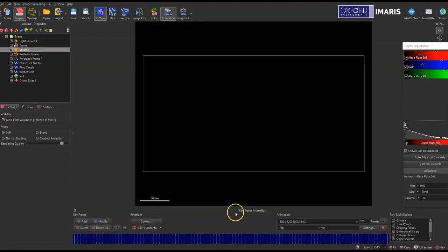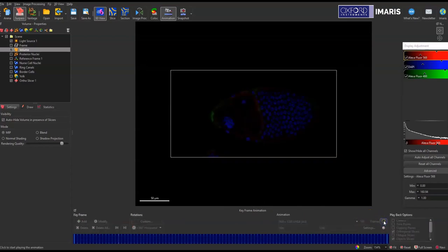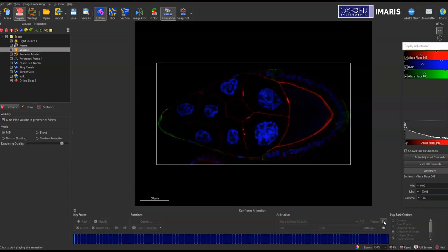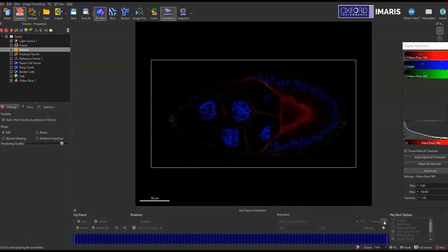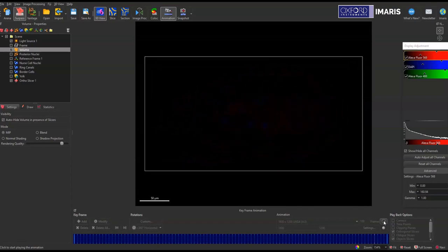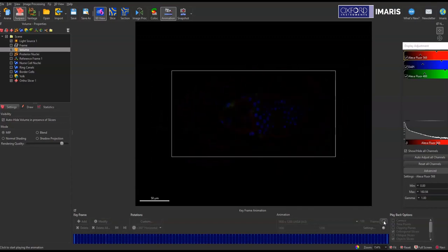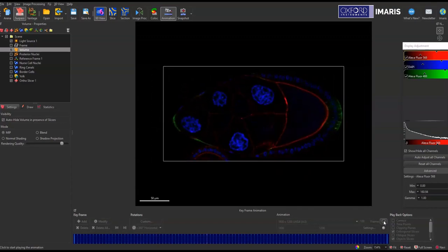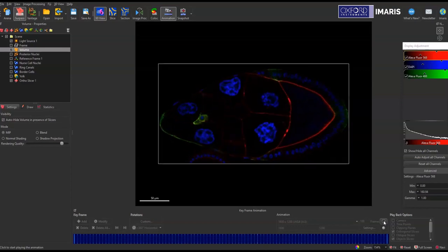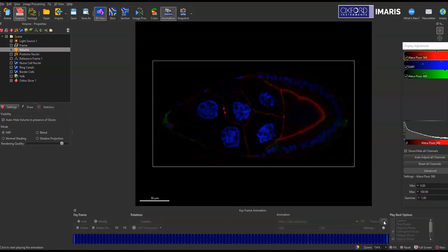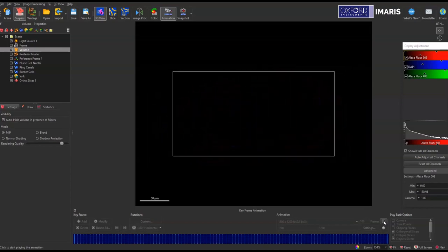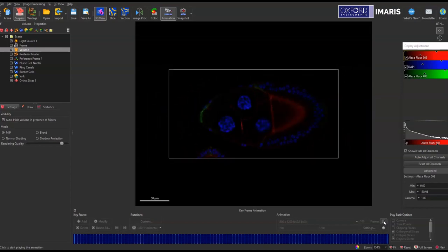And then we can press this play sign and watch what my recording will be. If I leave my animation exactly as it is here, just going through the Z stack one time, but whatever you have set up as your key frames, Imaris will interpolate in between those.